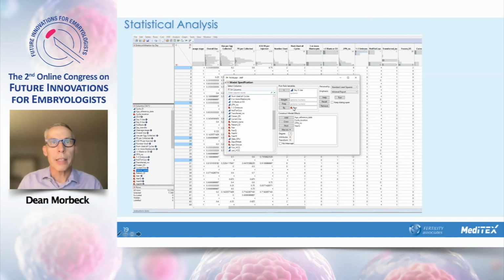I did this by year, and I used different variables here: the age of the patient, which clinic was located, the number of 2PNs for each patient, which we know is important for day 5 usable rate. And then I wanted to see if it changed much per quarter within a year.